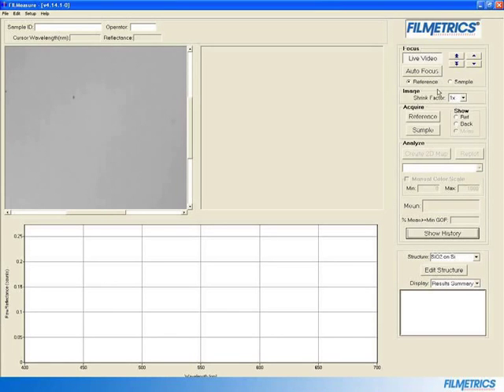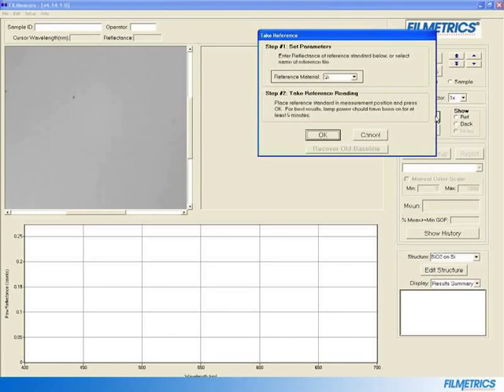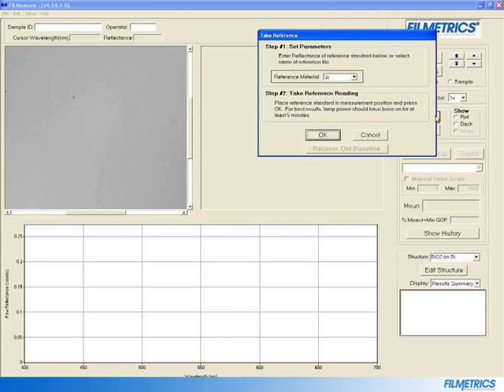Then click Reference. Be sure that the correct reference standard is selected, in this case it will be Si. Now click OK.